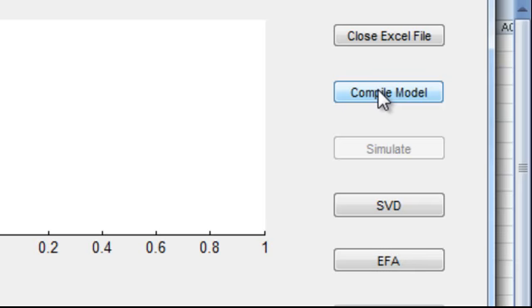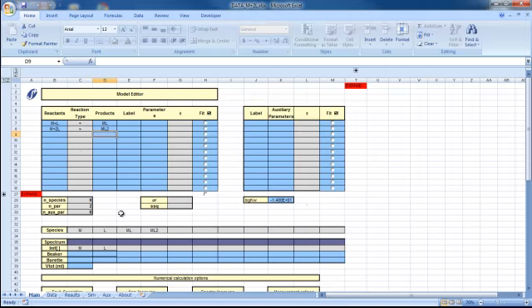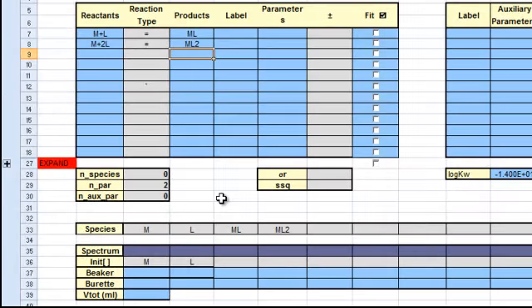During compilation, ReactLab reads in and interprets the model, identifying all the interacting reaction components, M and L in this example, and all the reaction species according to the mechanism. These names are written back to the workbook to provide column headings for the model-dependent configuration settings and the output of analysis results later.